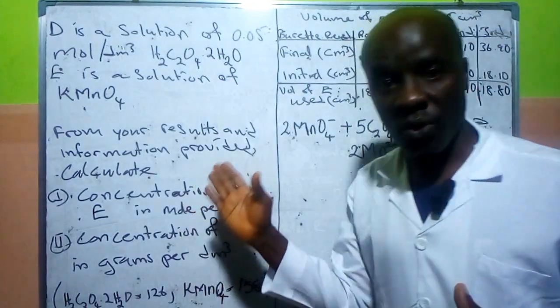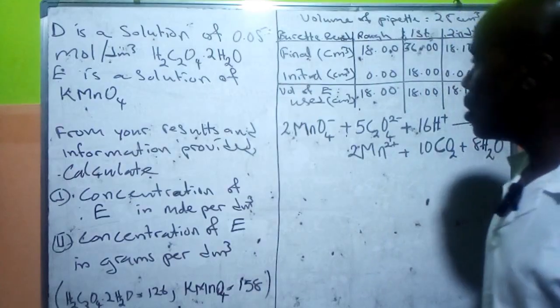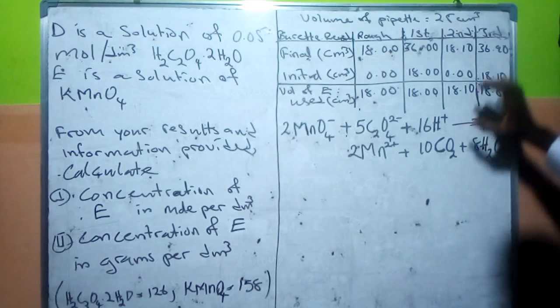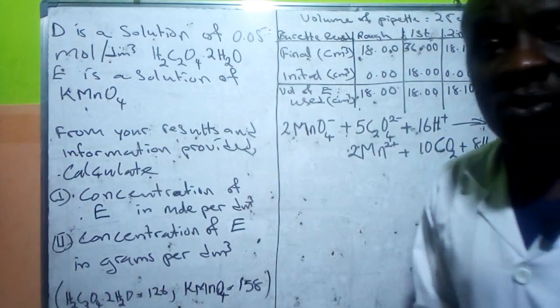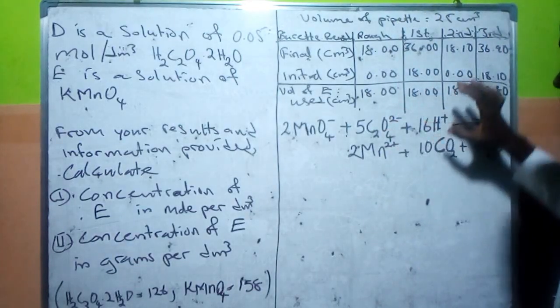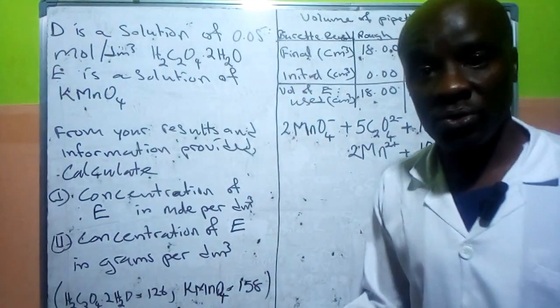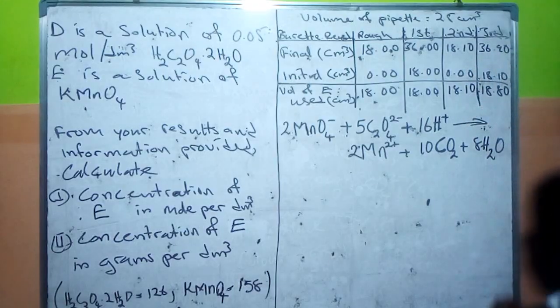And this is just my own prediction of the exam. This is what I was able to get from my own analysis. In the analysis, what I used is 2 mole of tetraoxosulfate(VI) in acidifying it. I think that may be why I got something like that, because I've been able to go through some books and found out that 1 mole can also be used. So what I use here is 2 moles, and this is my value.